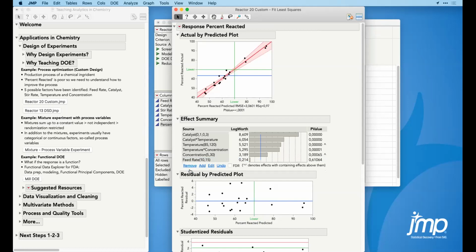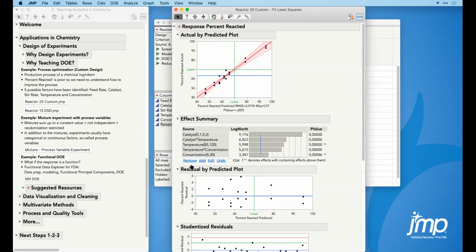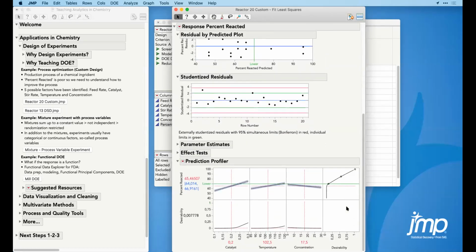And you remove also this one here. Then we have 5 effects left for these 3 factors. And then you can also look into interactions, for instance, and see how any changes change your response.